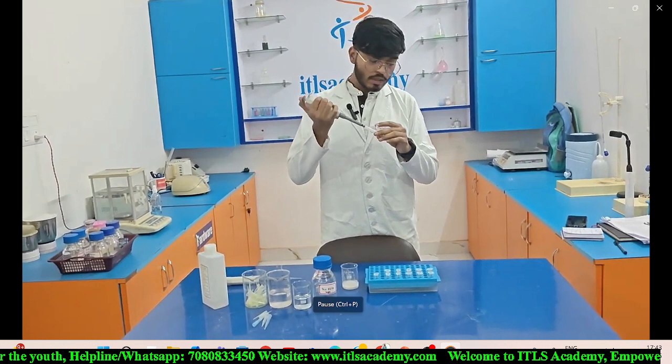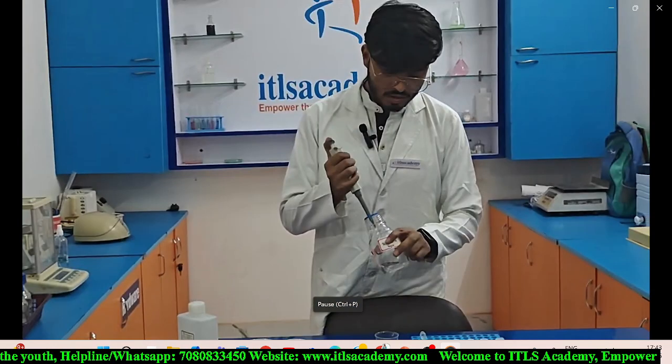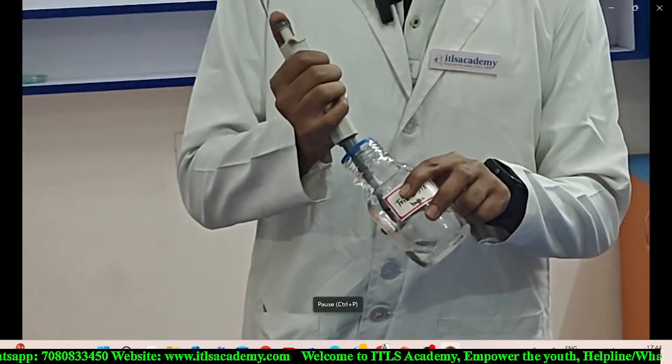So after discarding the supernatant, I am going to add 50 microliter of TE buffer, and after adding this TE buffer, we are going to store the Eppendorf tubes.